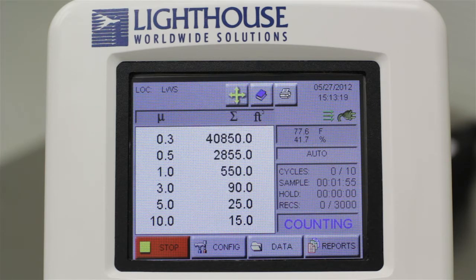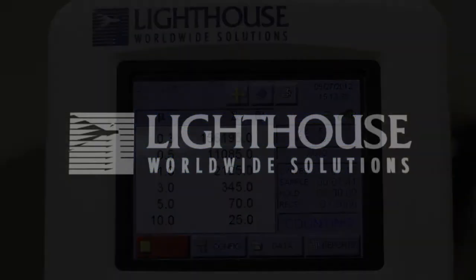Your Lighthouse particle counter has the ability to store multiple sample configurations as recipes, and you can mark your samples with location labels. These and other more advanced features are covered in additional tutorials found on our website. Thank you for choosing Lighthouse Worldwide Solutions — we are here to make a difference.